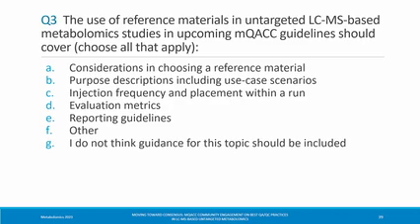So I would say yes, and I'll give you 2 examples. The first we've already heard from Tracey, that if you have redundancy, then you can use it to assess experiments that would otherwise have to be junked. And we have also found it exceptionally useful for having an independent QC sample to test our bioinformatics methods. So anything you do for batch correction or anything, it massively improves your assessment. The big issue is always cost.